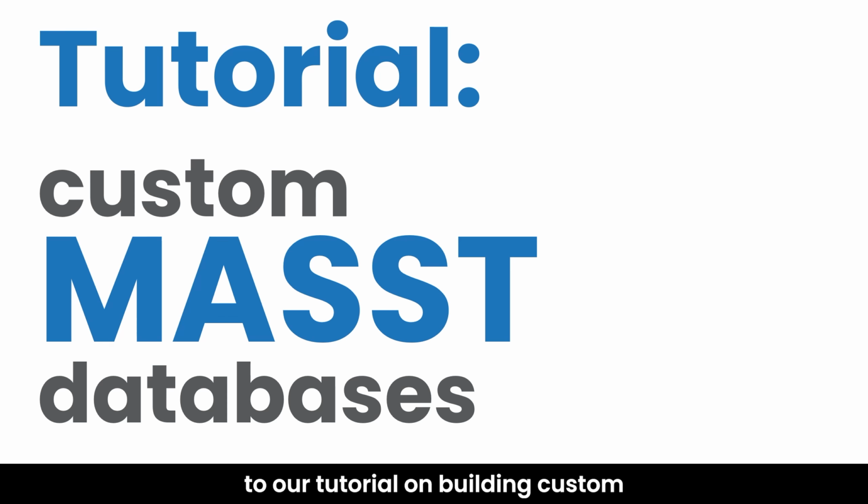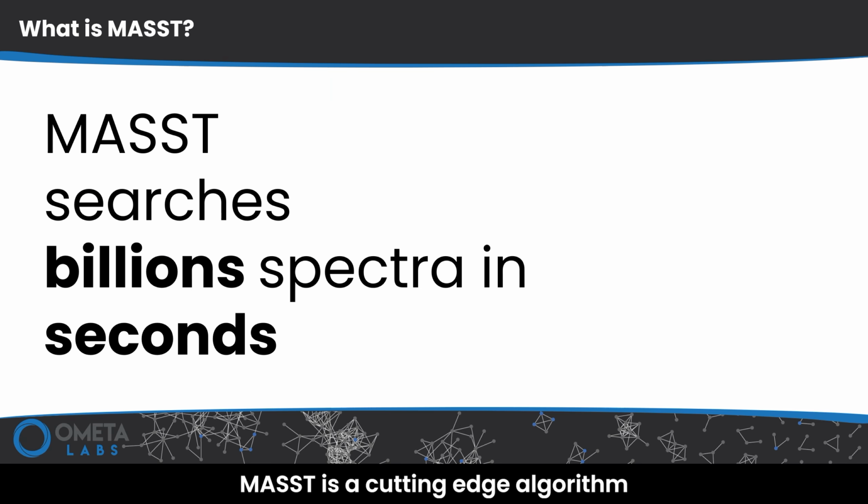Hello and welcome to our tutorial on building custom MASST databases. MASST is a cutting-edge algorithm for searching mass spectrometry data. Similar to the BLAST tool in genetics, MASST searches entire databases for matches to an input spectrum. And because MASST can search billions of spectra in seconds, this tool enables you to answer the question, "Where have I seen this molecule before?" in about the same time it takes to ask it.